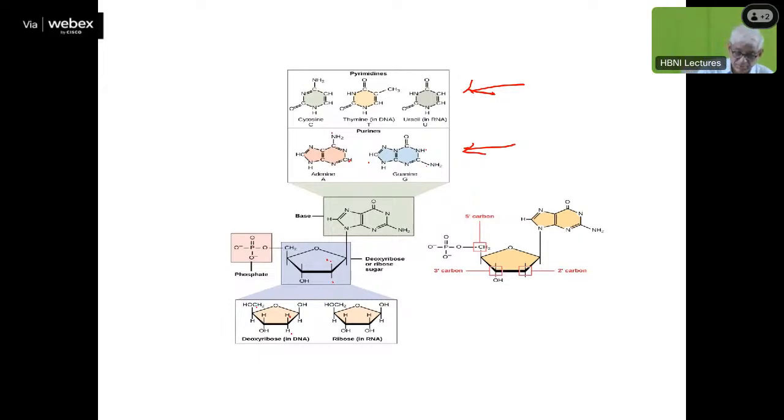Okay, so this is an expansion. These two are for the expansion of this sugar ring. Call it a 5-membered sugar ring. It can be deoxyribose or ribose. And the ribose has OH at the C2' position. This is called the C2' position, which is indicated to you. And this is the C3' position. And the chain continues in the direction 5' to 3'.